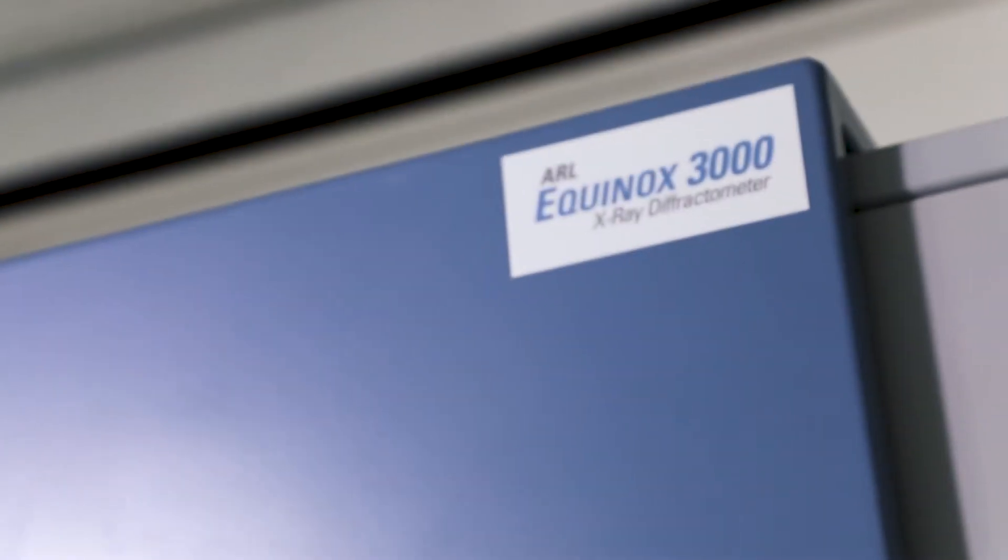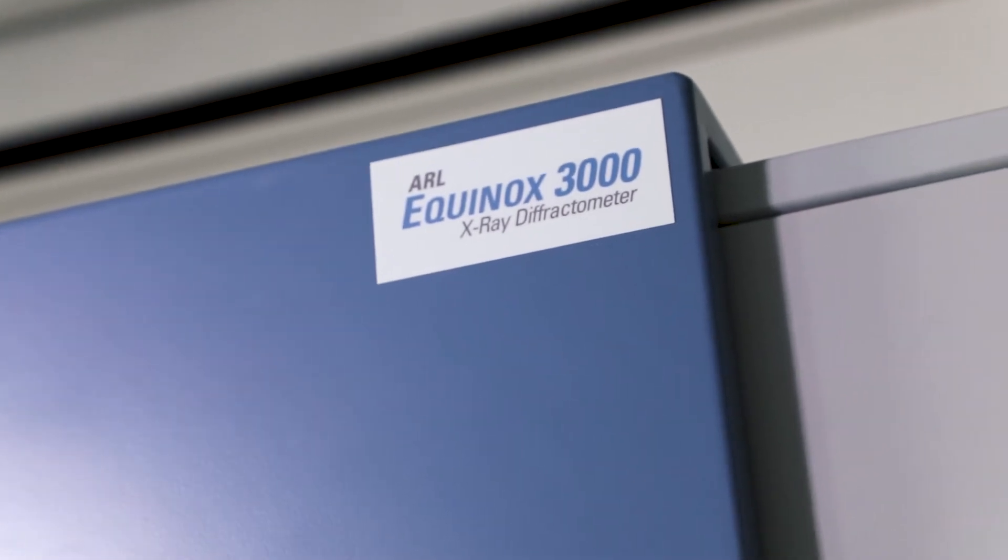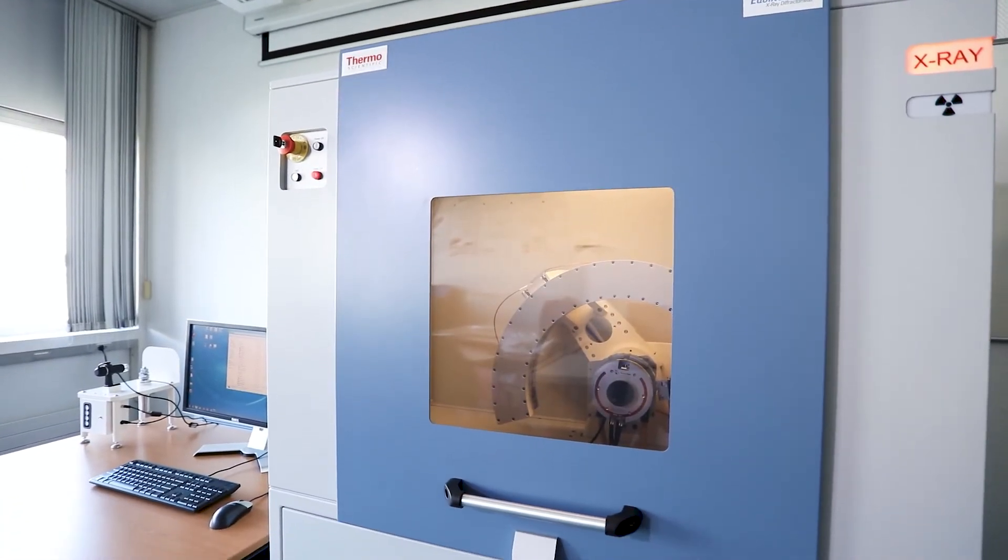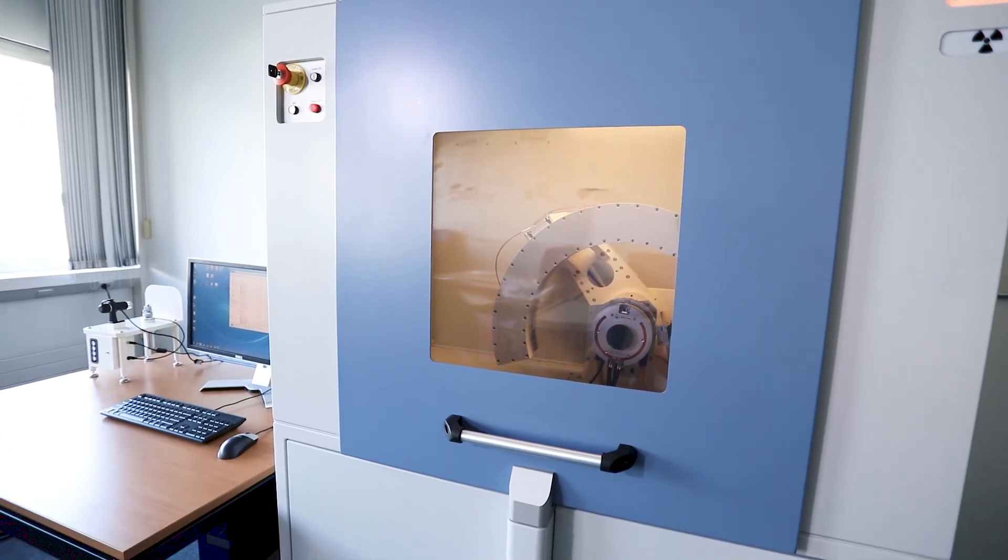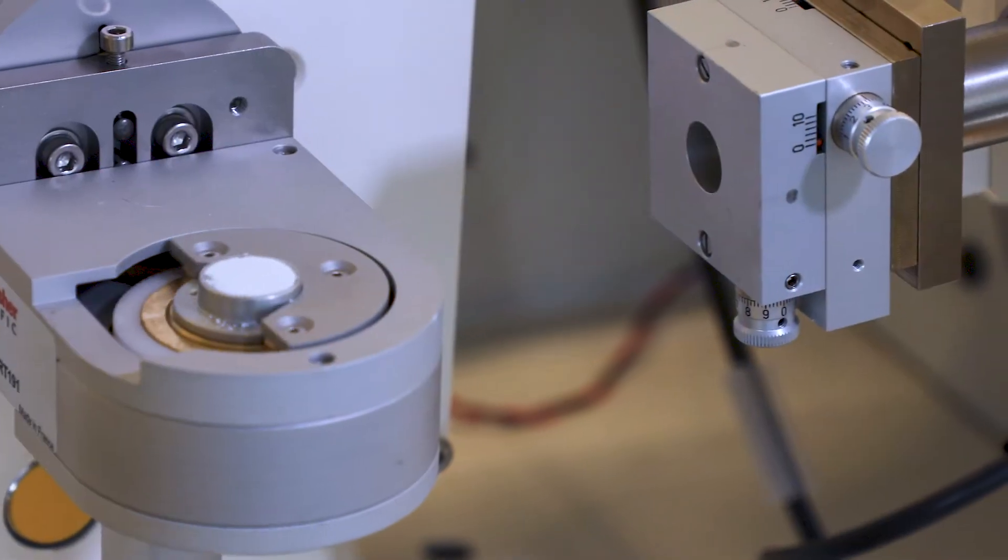Thermo Scientific ARL Equinox series is designed for reliable and robust operation in laboratories ranging from production control to research applications.